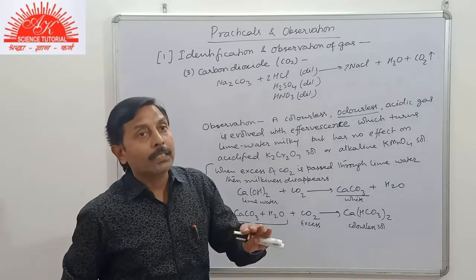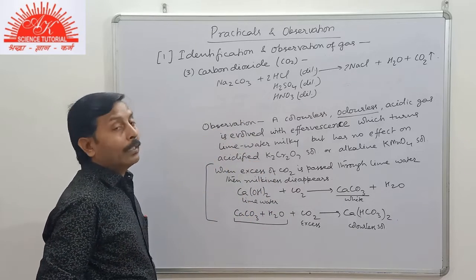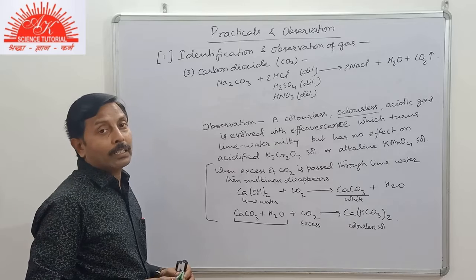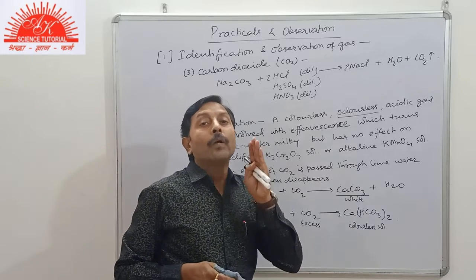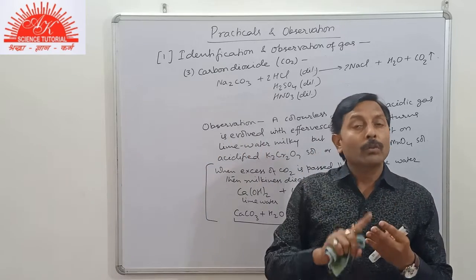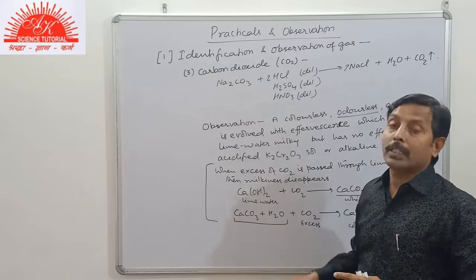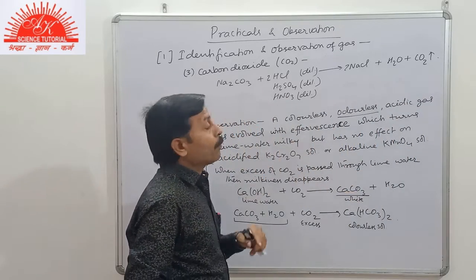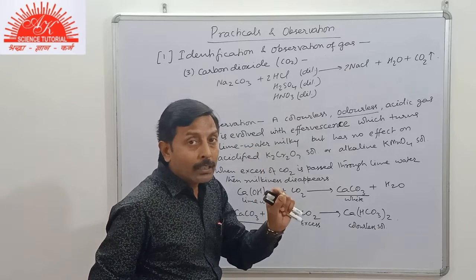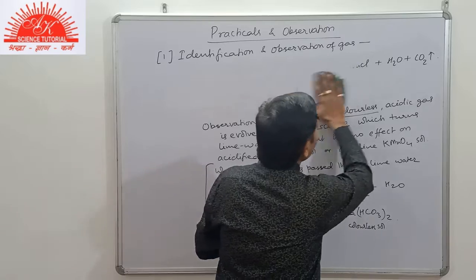So students, this was about carbon dioxide. In any reaction, any practical, wherever CO2 is produced, you will write this type of observation, or on the basis of this observation you will write that the gas evolved is carbon dioxide.